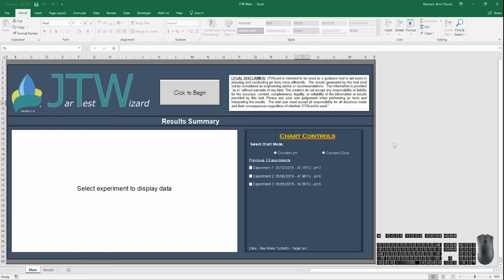JTWizard is an Excel-based jar testing companion that is meant to guide you through the entire jar test process and make the whole thing easy, straightforward, and efficient to do. In this video, I'll show you how to use the tool and demonstrate some of JTWizard's capabilities.